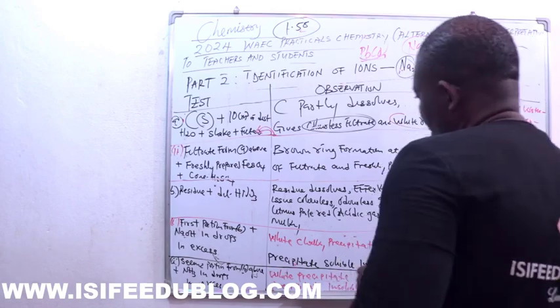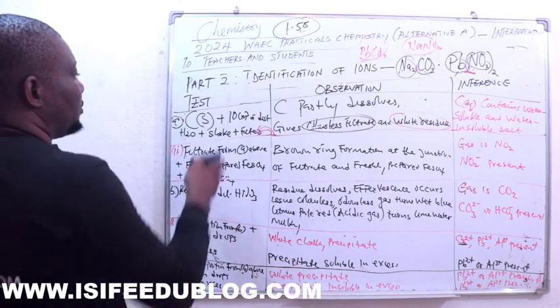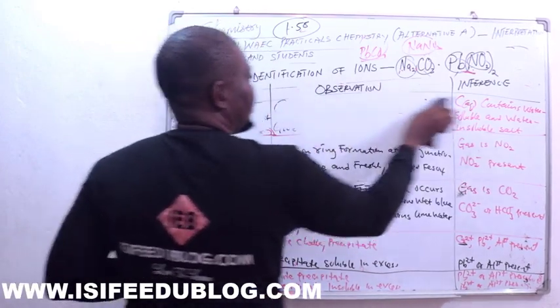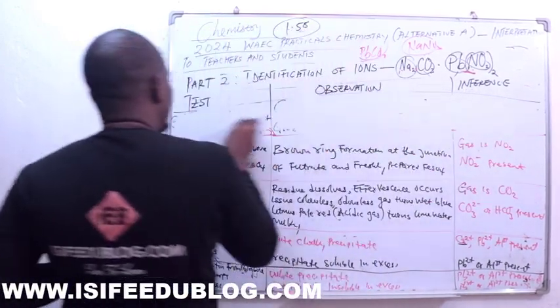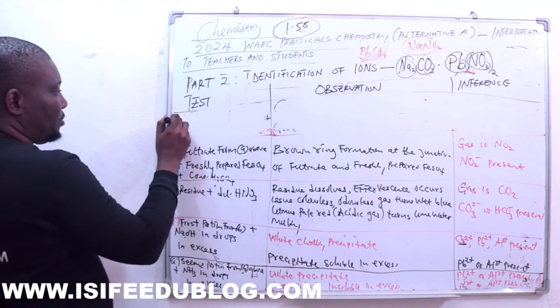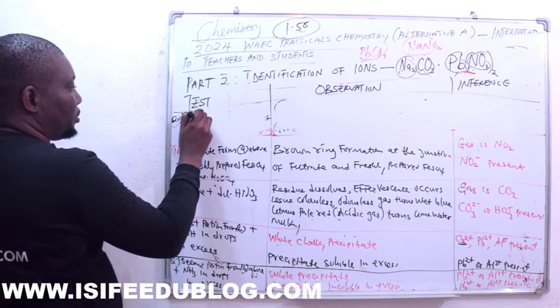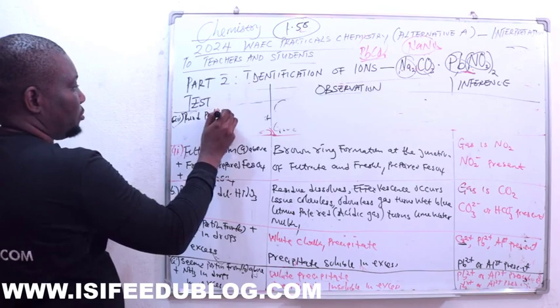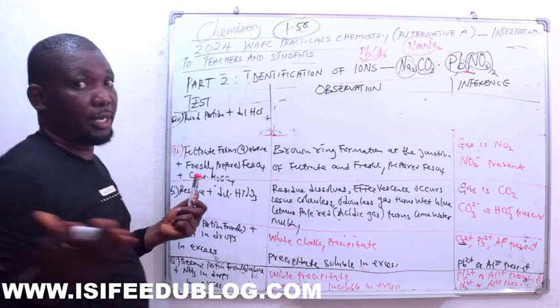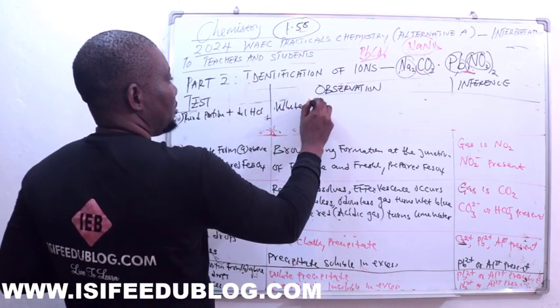Now this is the point where we confirm it with HCl. So to round it out, we have III. That means for our third portion, plus dilute HCl, you have a white precipitate.